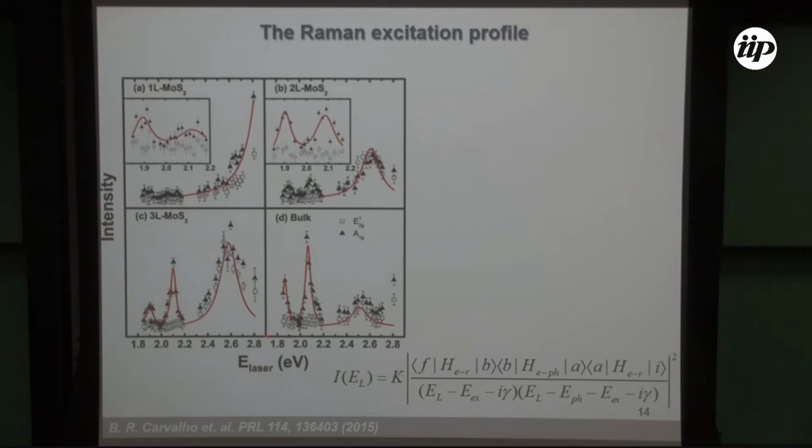And we can see that these are present for all the samples, but their intensity decreases considerably, a lot actually, when you are in bilayer and monolayer. However, if you notice, the in-plane mode does not couple with these A and B excitons. However, we have a peak at a very high energy, related to the C peak that we saw in Louis' paper.